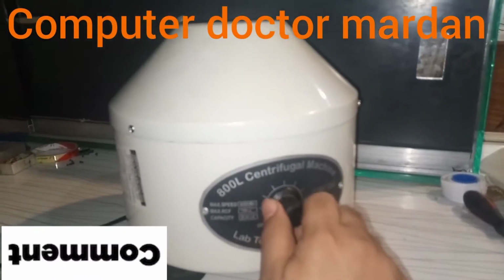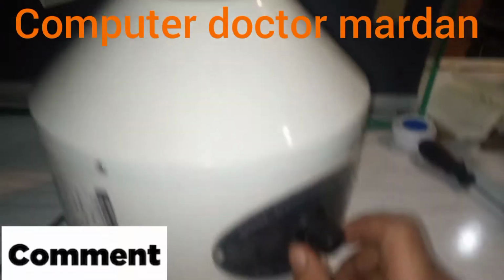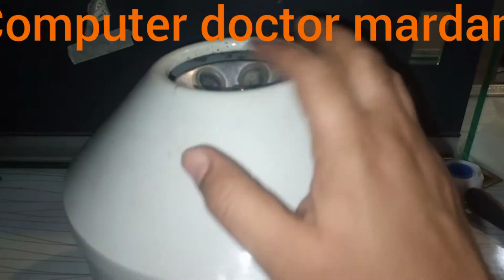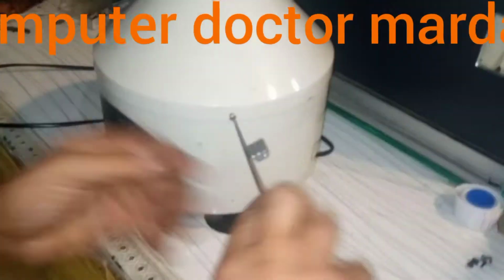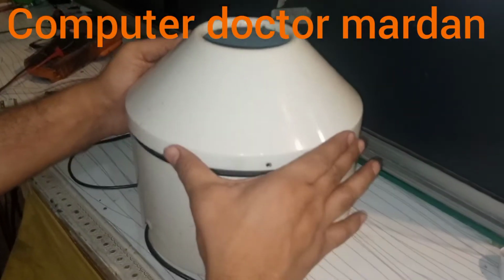So dear customer, now I'm checking this centrifugal machine. It's all on, but there is no power. It's not working. So that's not working. There's no power. Now I open this machine.